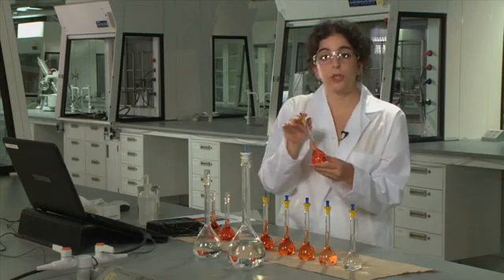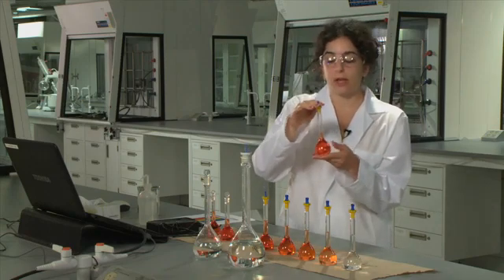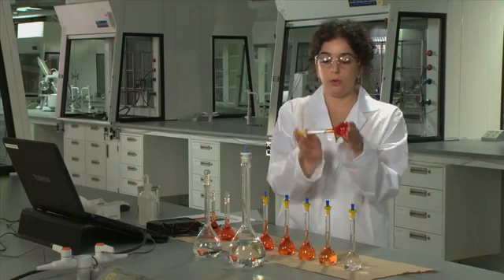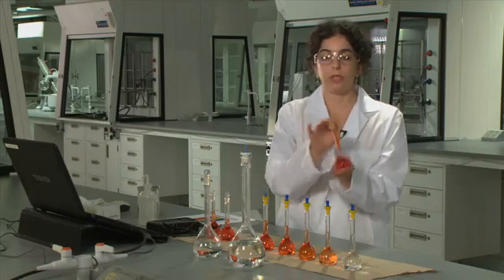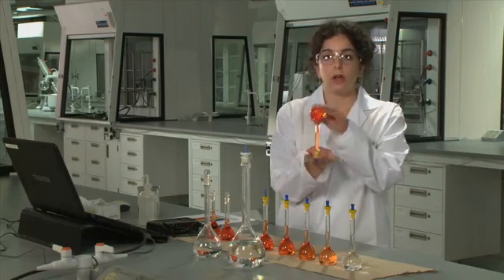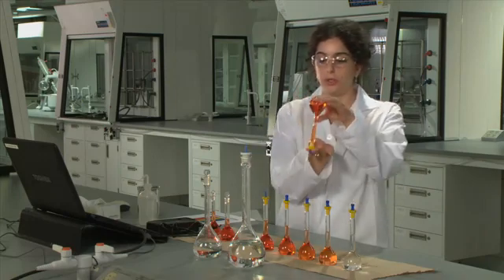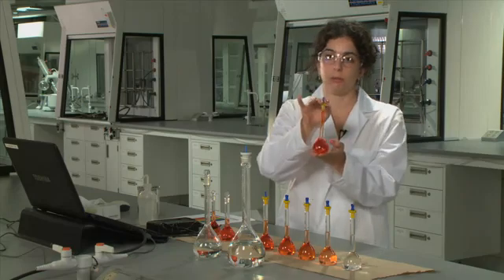When you're preparing any solution with a volumetric flask, you want to ensure that you invert several times, just to ensure that your solution is thoroughly mixed.